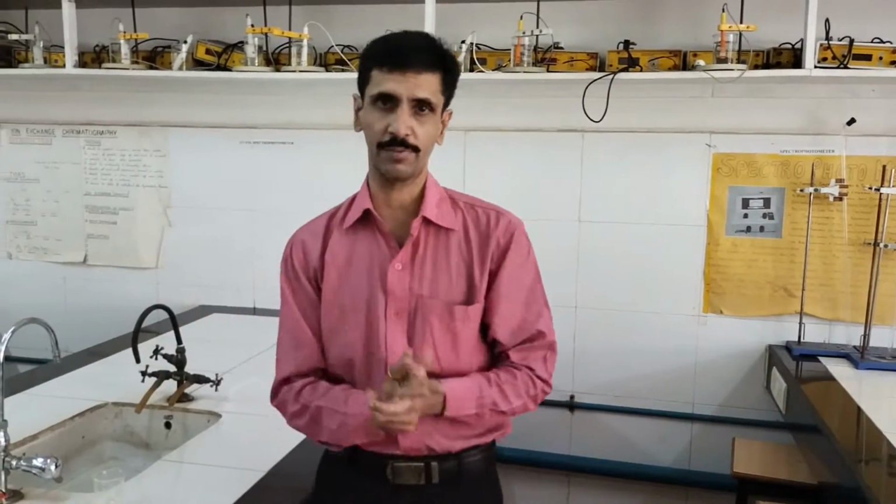Hello my dear friends. So here I am with the practical demonstration of Ostwald's dilution law. I will explain to you the theory behind this particular experiment. Now we go into the practical demonstration of this.